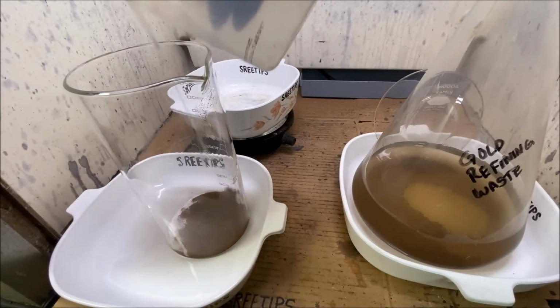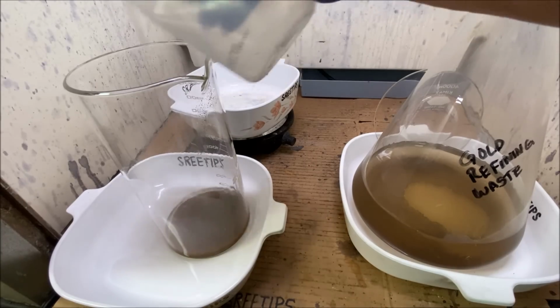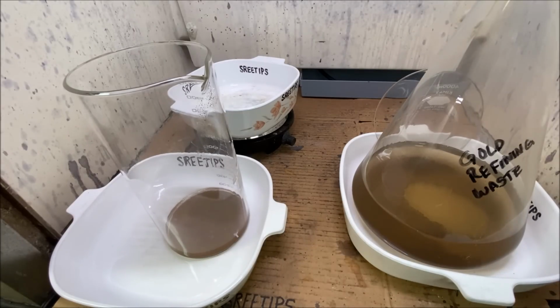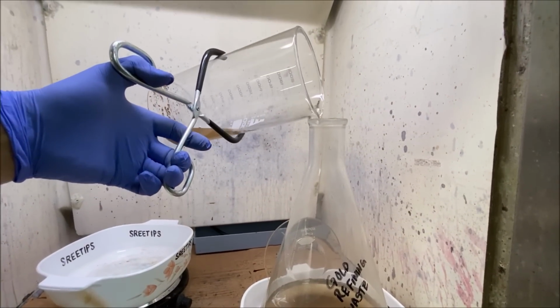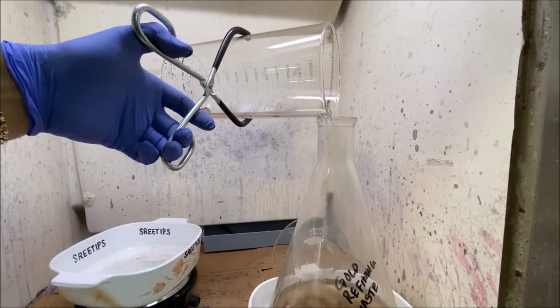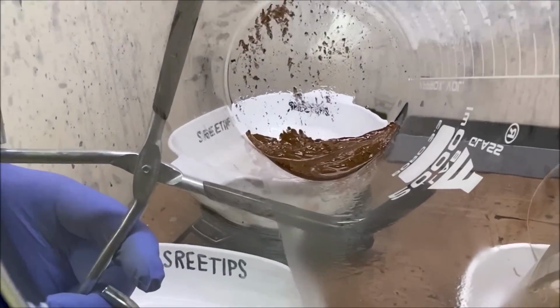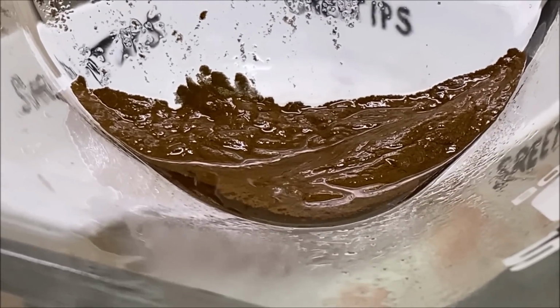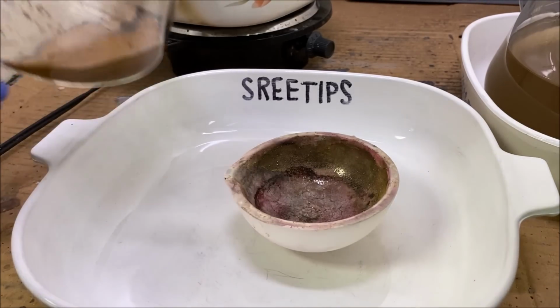Going to rinse it off with some fresh water, distilled water actually. Try to get all the acid rinsed off that I can. It's not looking too bad for a single refining. Here's how it looks after we've boiled it in some hydrochloric acid. Now we're going to transfer the gold into a melt dish.